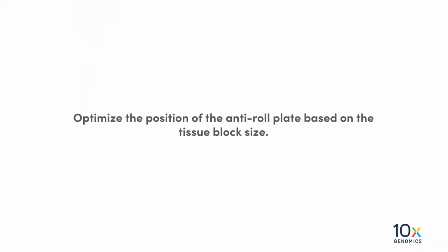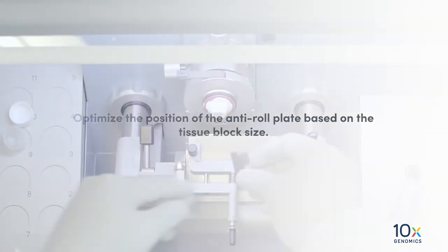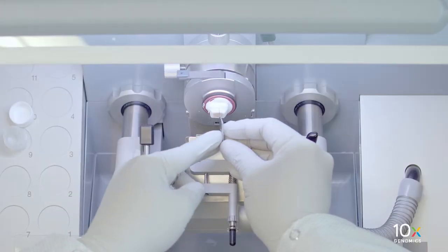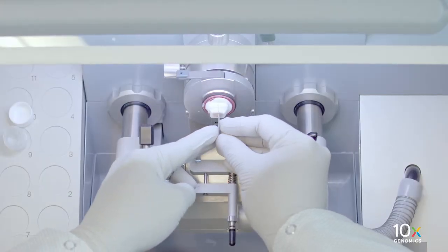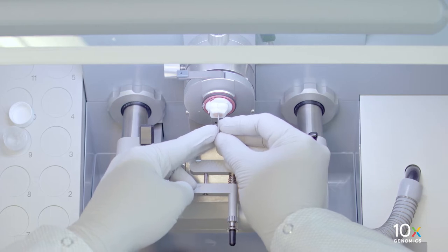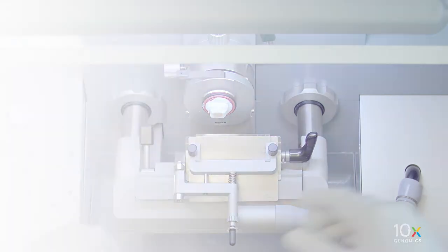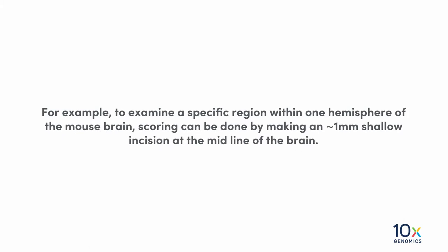Optimize the position of the anti-roll plate based on the tissue block size. To score, make a shallow incision about 1 mm deep on the cutting surface of the tissue with a pre-cooled razor blade. For example, to examine a specific region within one hemisphere of the mouse brain, scoring can be done by making an approximately 1 mm shallow incision at the midline of the brain.